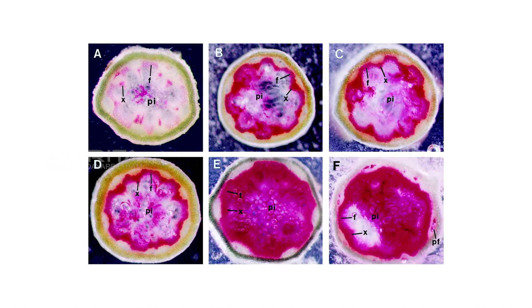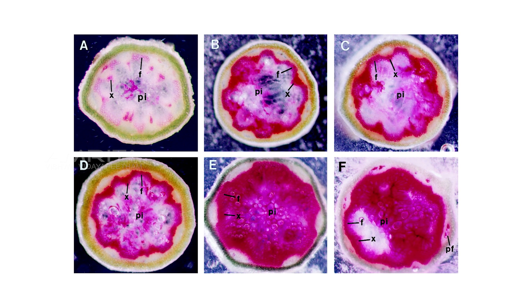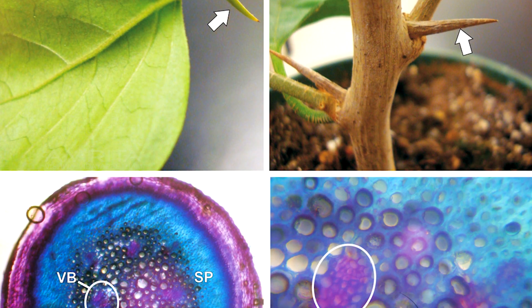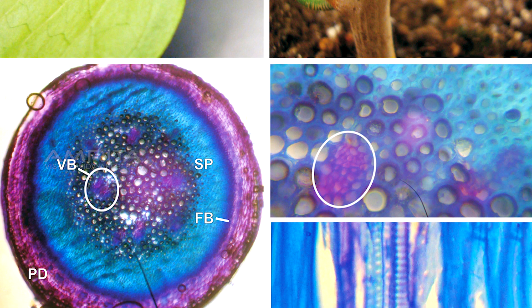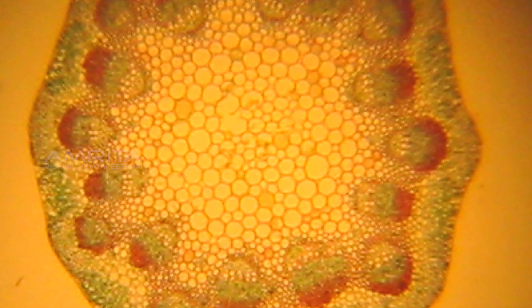In the lower part of the stem, more xylem cells and interfascular fibers are formed. Consistently, intense lignin staining is seen in these sclerenchyma cells too. No lignin staining can be detected in the cortical cells or the pith parenchyma cells throughout the stems.